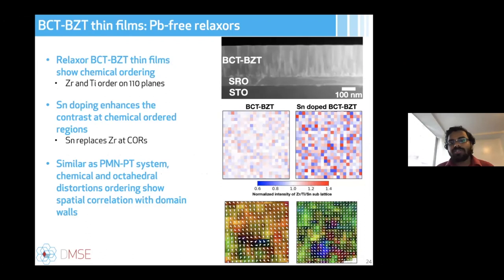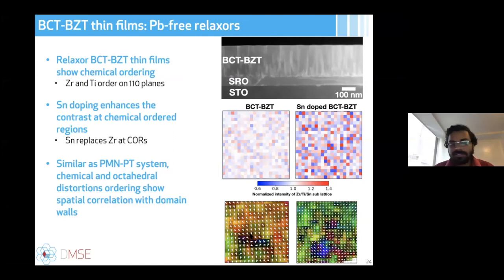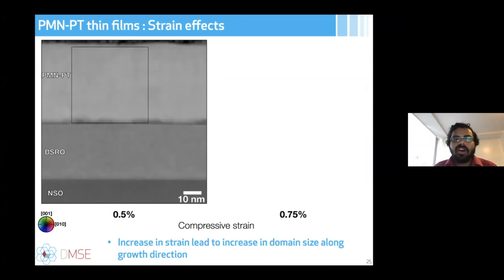This theory also applies to other systems. In BCT-BZT lead-free thin films, zirconium and titanium form chemical order regions along the 110 plane that impede long-range polarization, along with octahedral distortion regions. This confirms that the presence of energy barriers as inhomogeneities correlated with domain walls can be generalized across different material systems.